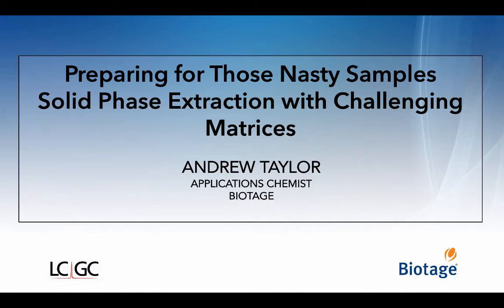Well, so how do you complete your extraction if you form an emulsion? In SPE, it's really rare that you should run into an emulsion, but in the few instances that you do, the best thing that you could do is use a phase separation membrane and try and physically separate out the emulsion. What should you do if your sample's oily or soapy?